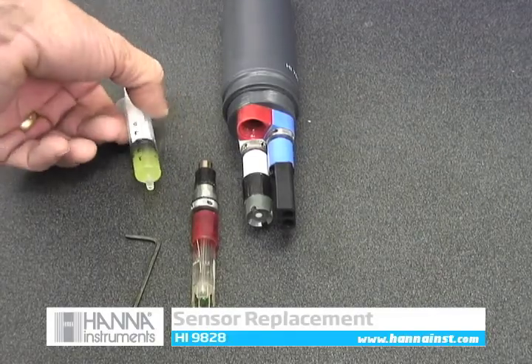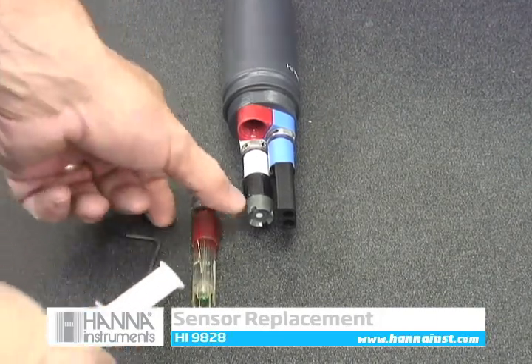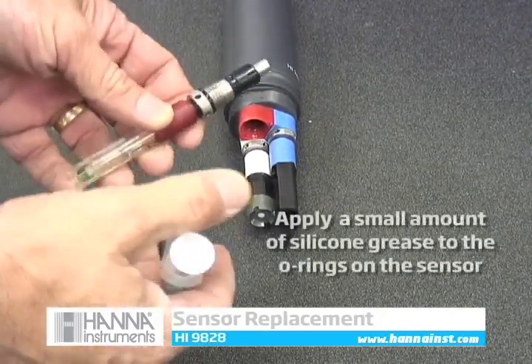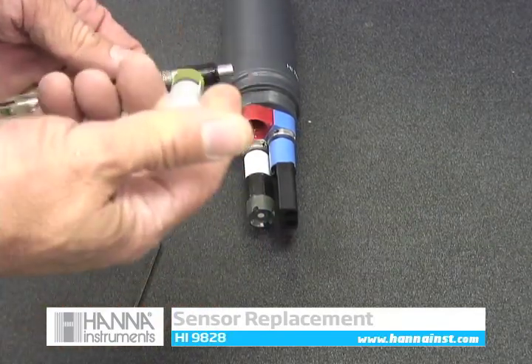Sensor replacement is easy and we'll show you how. Here we have a plastic syringe filled with silicone grease. The included silicone grease needs to be applied to each of the o-rings before inserting it into the sonde. This will assure the integrity of the o-ring and seal.